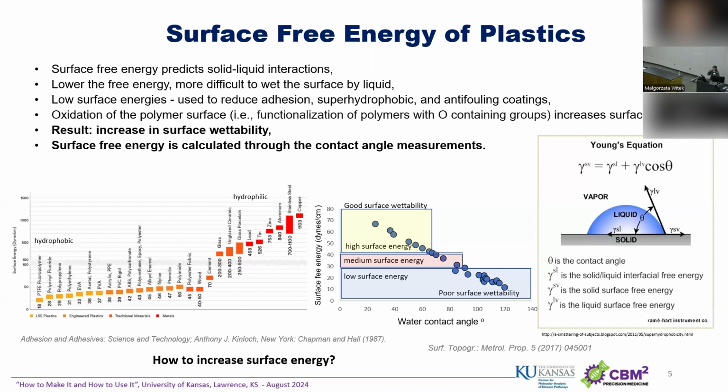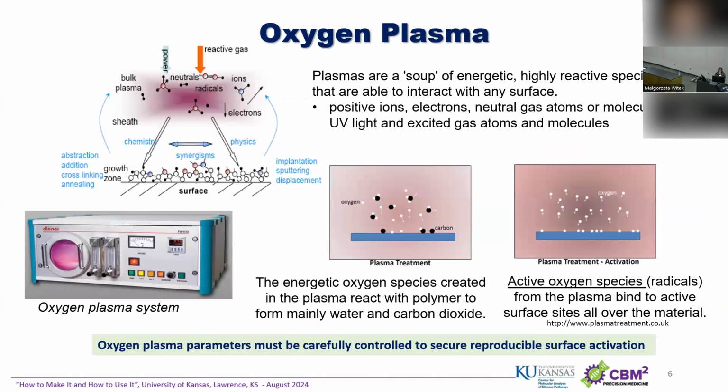Based on how you draw the tangent of this water contact angle, you're going to end up with very high water contact angles. Low energy, high water contact angle means a hydrophobic surface. High energy, low water contact angle tells you it's a nice and hydrophilic surface. And we'll show you that also in the lab, so you have first-hand experience with the evaluation.